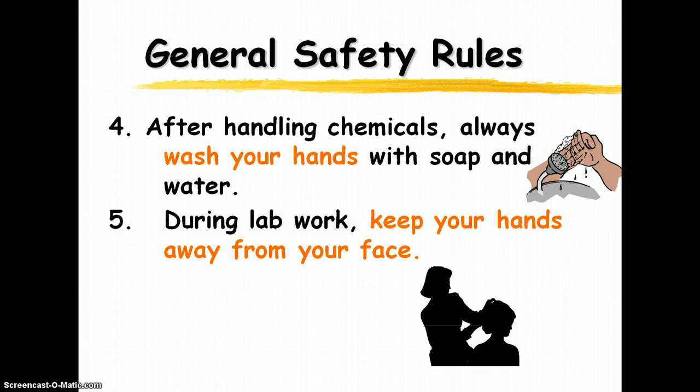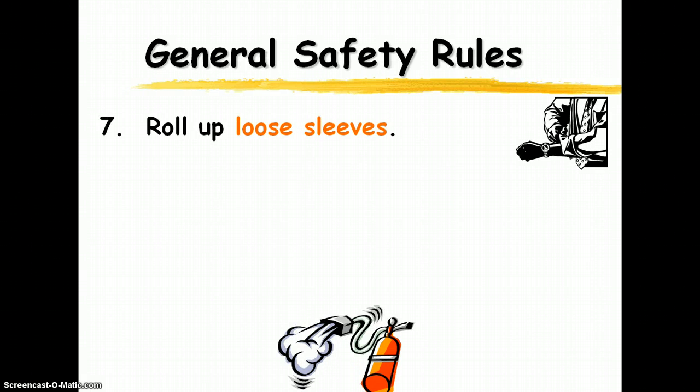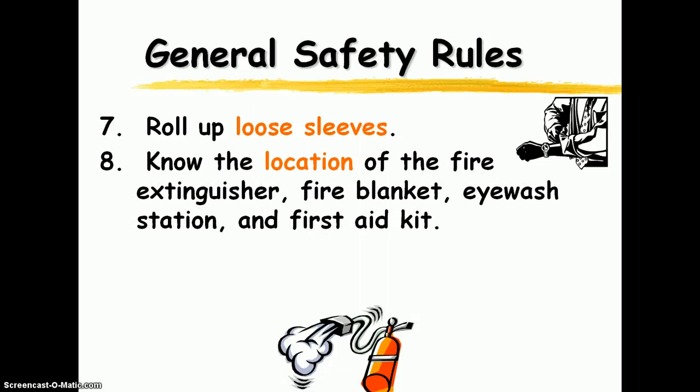Keep your hands away from your face while you're doing lab work, because you don't know what chemicals are on them and you don't want them getting in your eyes, nose, or mouth. Tie back long hair — you don't want that dragging in your specimen or chemicals. Make sure you tie that back and roll up your loose sleeves. That goes for anything that's dangling: loose sleeves, a jacket, jewelry — take all of that out of the way so it doesn't drag into your experiment.